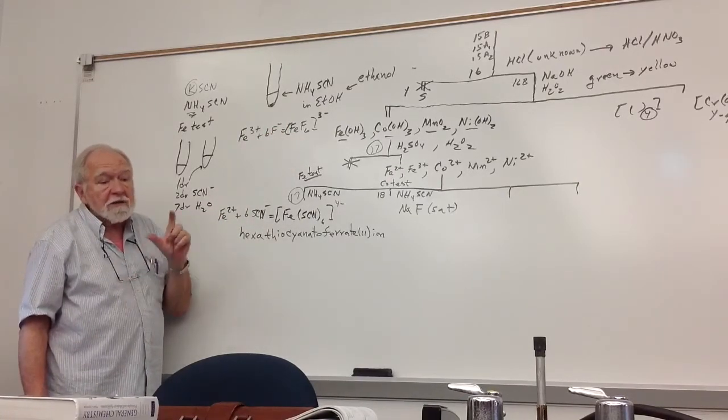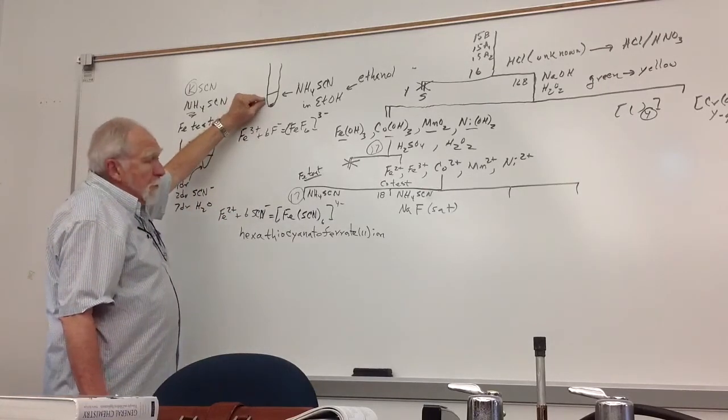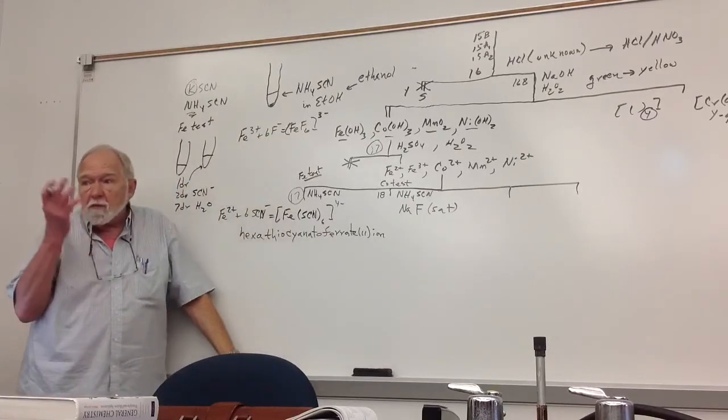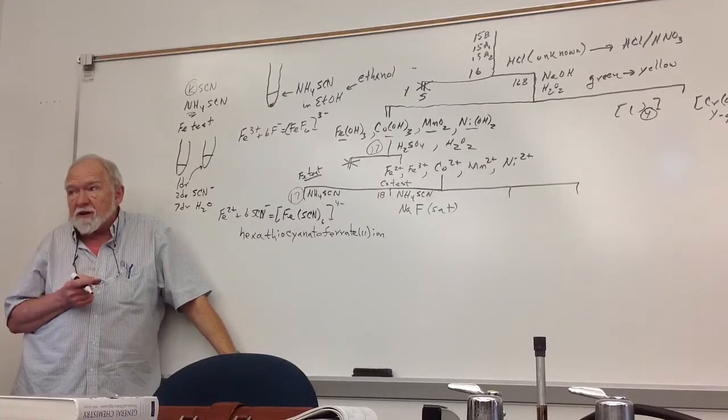Now sometimes people will discover that this solution is sort of a purple color. That means you didn't add quite enough fluoride. You can go back and add a little bit more fluoride, stir it up and centrifuge it. It'll remove some more of the iron.